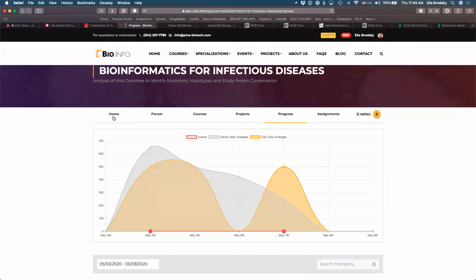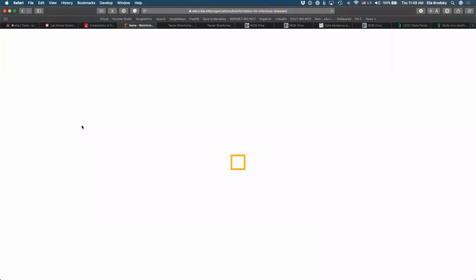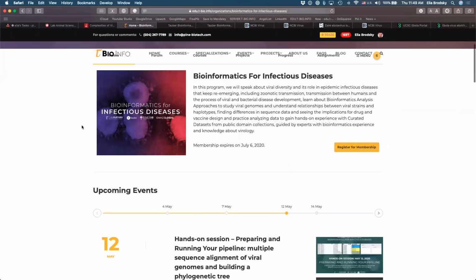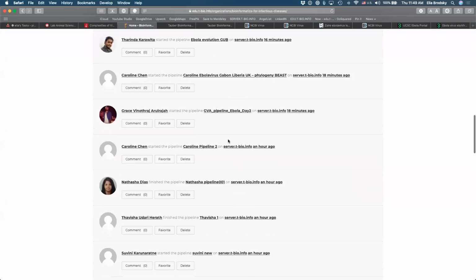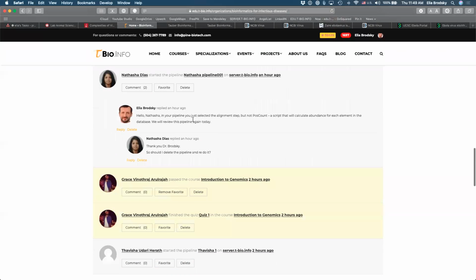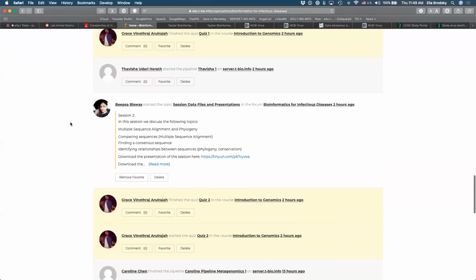You can see that we've already been interacting with a number of users that have been doing that right here on the home screen. So please go and review here. You can actually go to some of these pipelines that other people ran and see what is going on.